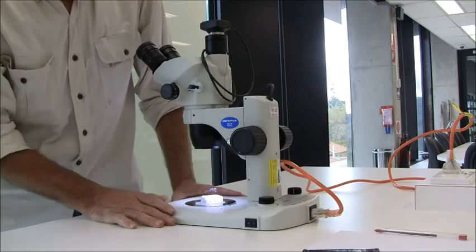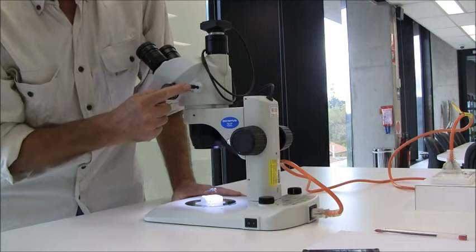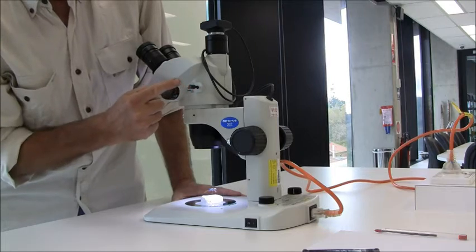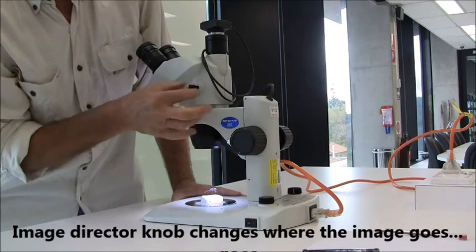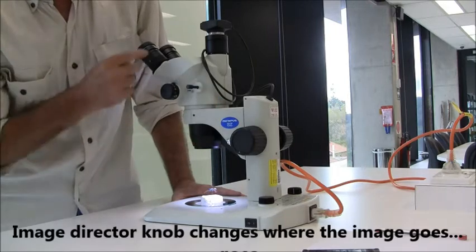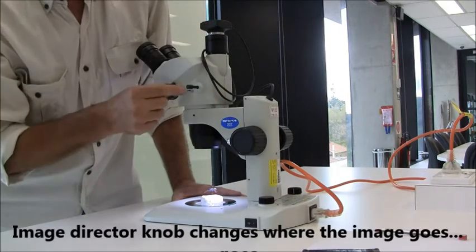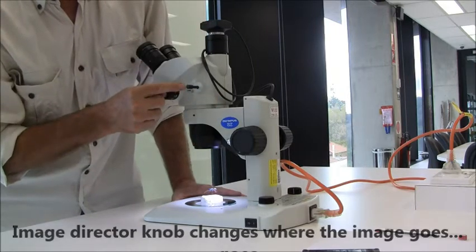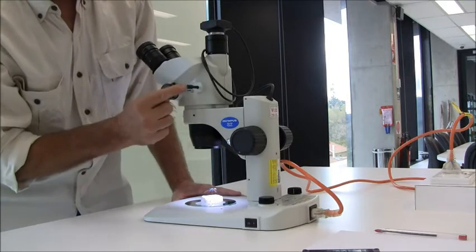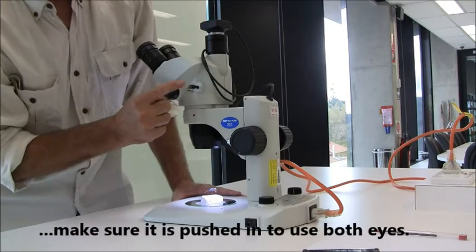The next thing in setting this up is to make sure that this little knob is pushed in. It's pulled out to send the image to the camera and then to your computer. But if you want to use it using both eyes that knob has to be pushed in.